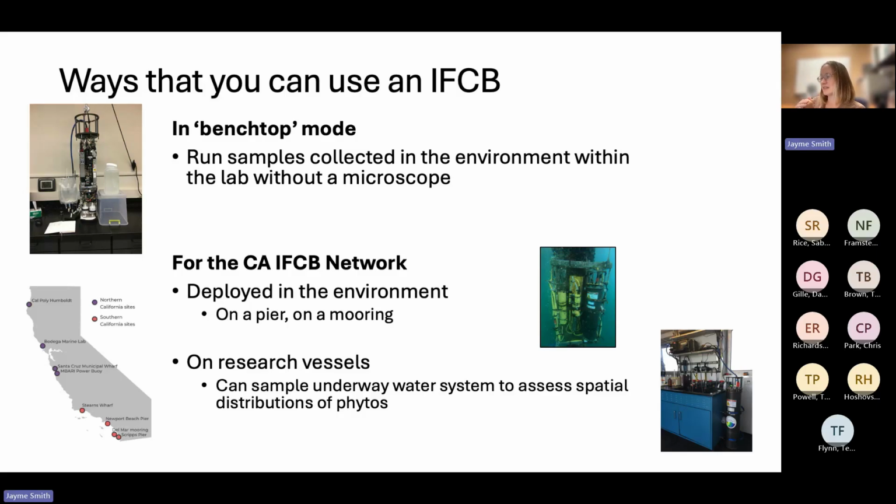So if you have something like this and you're deployed, it's not a set it and forget it. You do have to pay attention to what's going on in the local conditions. On a big storm, you'll also want to turn it off, because if it floods when it's on, that's a major catastrophe. If it's off, there are salvageable things. So you make decisions based on conditions about whether you're going to keep it running or not.